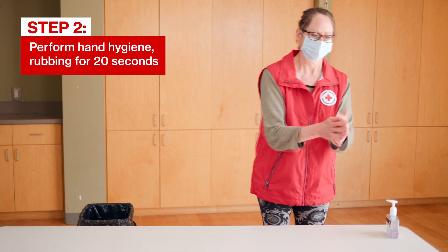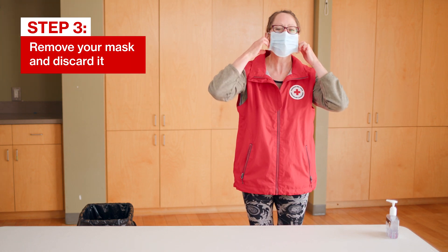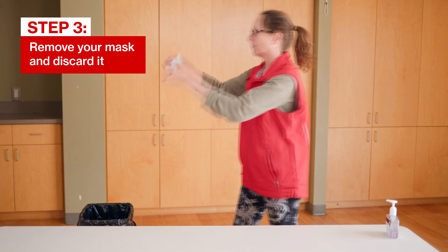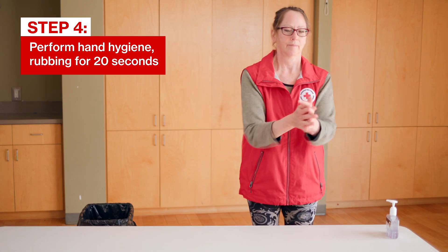Next, perform hand hygiene. Next, remove your mask. Grasp the ear loops or ties carefully to remove the mask and avoid touching the front of the mask. Discard. Lastly, perform hand hygiene.